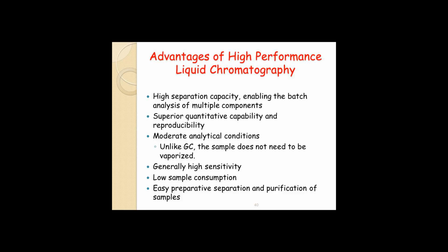Resolution equations relate the three factors such that high efficiency and separation factors improve the resolution of component peaks in HPLC separation. Internal diameter. The internal diameter, ID, of an HPLC column is an important parameter that influences the detection sensitivity and separation selectivity in gradient elution. It also determines the quantity of analyte that can be loaded onto the column.